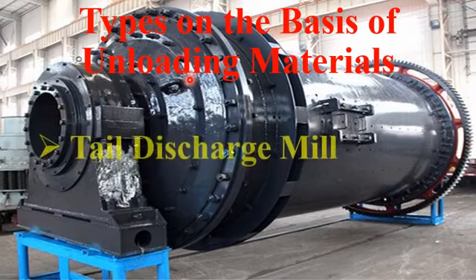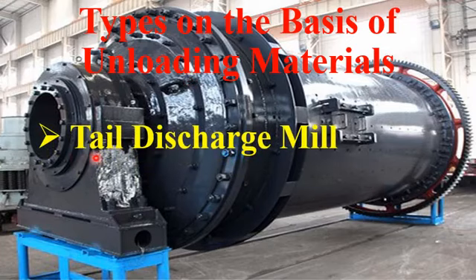First type of ball mill apparatus is known as tail discharge ball mill apparatus. Okay, dear student, please note that in the tail discharge, the head and tail of the tail discharge mill are used as inlet and outlet of the materials.